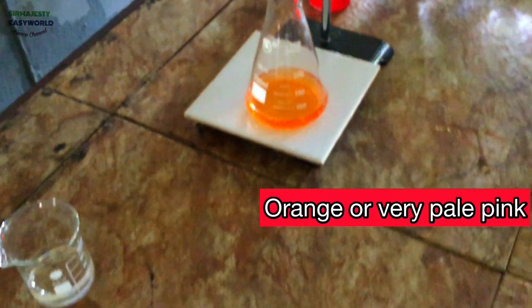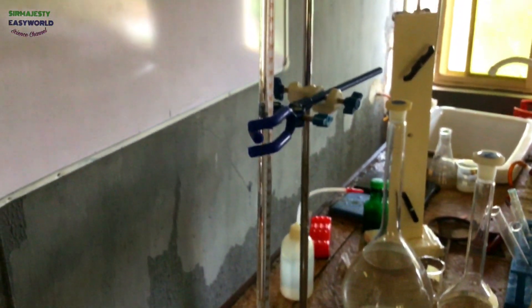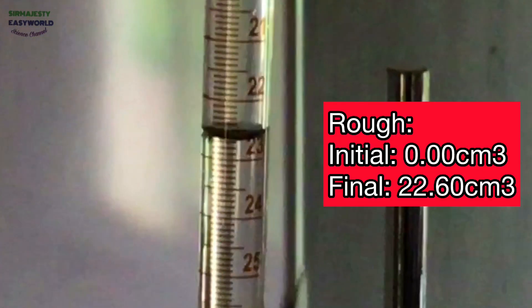You look at the color orange at endpoint. Make sure it is not red — red means you have added excess acid. On a closer view, this is 22.60. Remember our initial is 0.00 cm³.